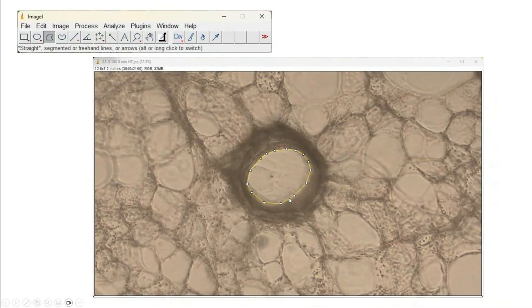And when you apply, in the case of a mouse, beta-methacholine, say 5 micromolar, this will start to contract, and this lumen will start to shrink, and that will happen over minutes. It might take 5 minutes. As you do a time course, the contraction will increase over time, and the lumen will get smaller and smaller. So by 20 minutes, you'll have a very small lumen.